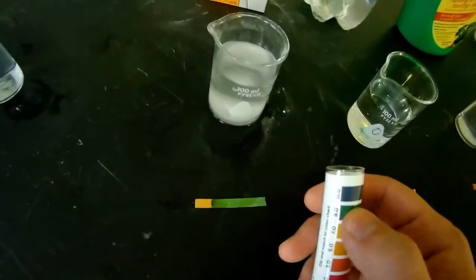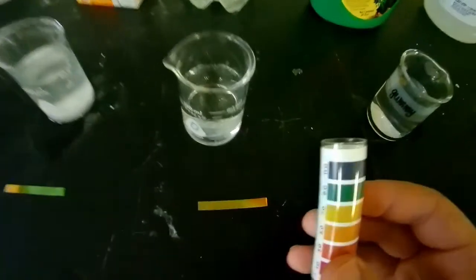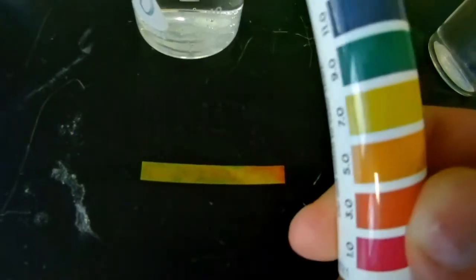For baking soda, pretty greenish, even getting into blue, so a little bit of a stronger base there, maybe a 10 on the pH scale. Moving on to carbonated water. At first, when I first dunked it in, I think it was slightly orangish, and you can kind of see that in some of the table. I think on the table when I put it down, there is a little bit of this white powder, which is baking soda, and that might be corrupting the pH strip. But on the side where you can see here on the right, it's maybe a little bit orangish, so maybe something like a 5-ish. Carbonated water is a slight acid. It's a very weak acid.